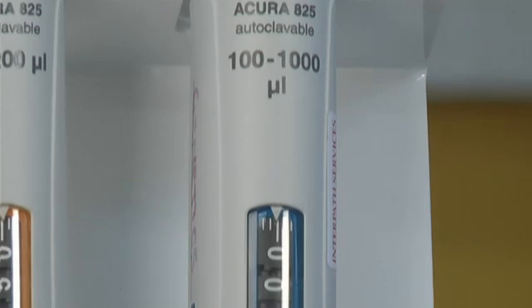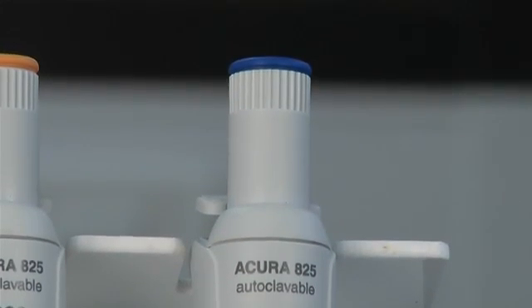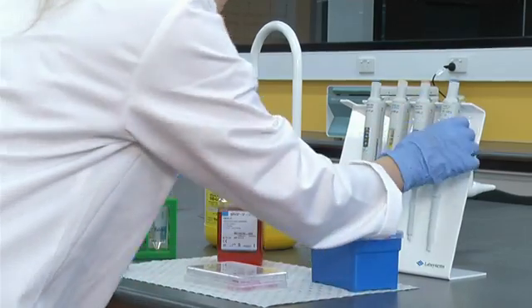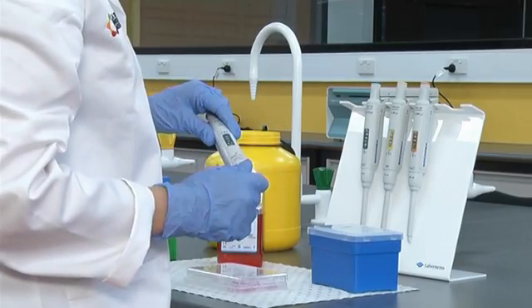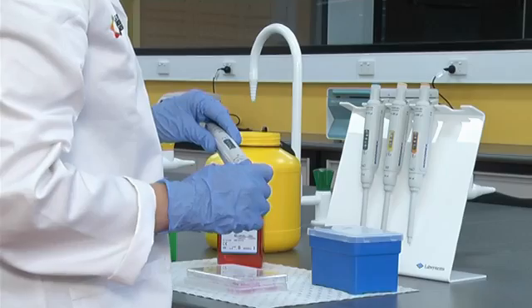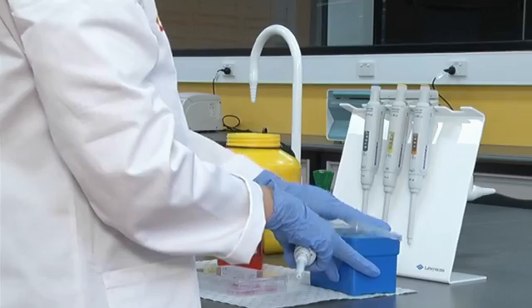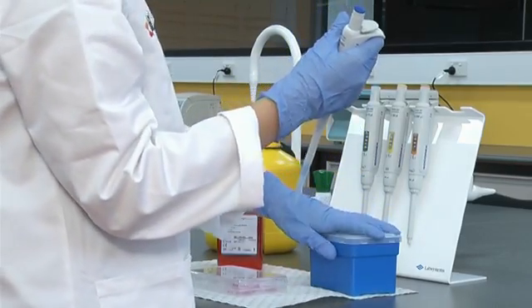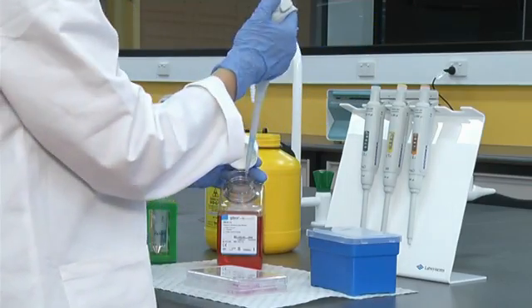Although the pipettes are colour coded, it is best to check the volume range printed on the pipette before you begin pipetting. It is important to choose a pipette where the volume you wish to pipette is close to the maximum range for that particular pipette. This is because the percentage error for a pipette is greater the smaller the volume you wish to pipette. For example, it is more accurate to use a 100 microliters pipette for dispensing 100 microliters than to use a 1000 microliters pipette.